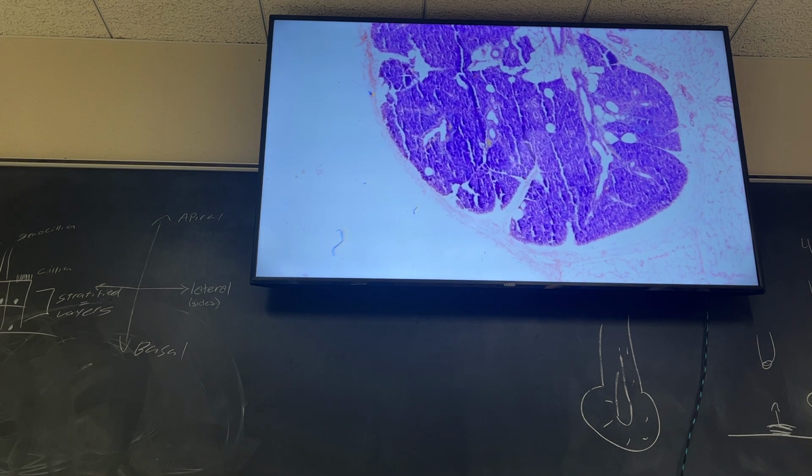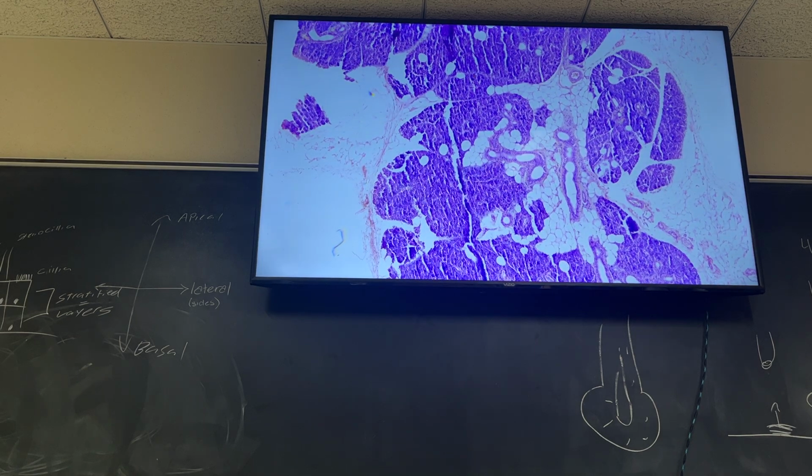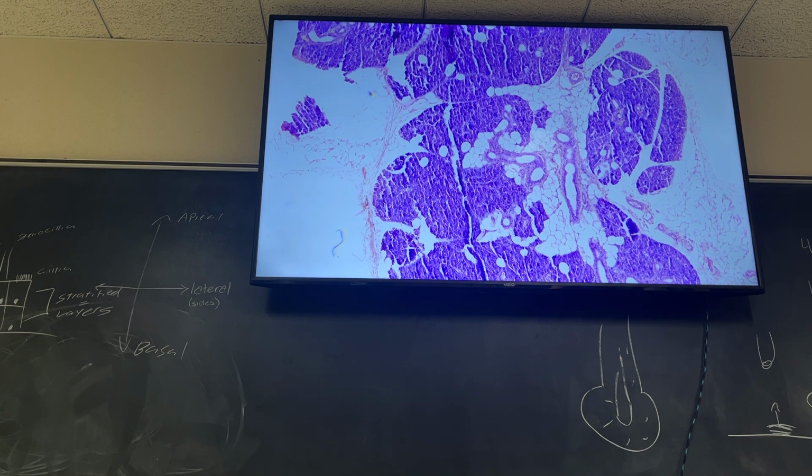The next slide I'm going to look at is the terminal ganglia slide. Oof, not that one. That's horrible. That's just bad. All right, we're not looking at that one. Where's that one slide we had of the non-striated muscle? That's probably a good one. We're going to go all the way back to the first slide that said smooth muscle section.